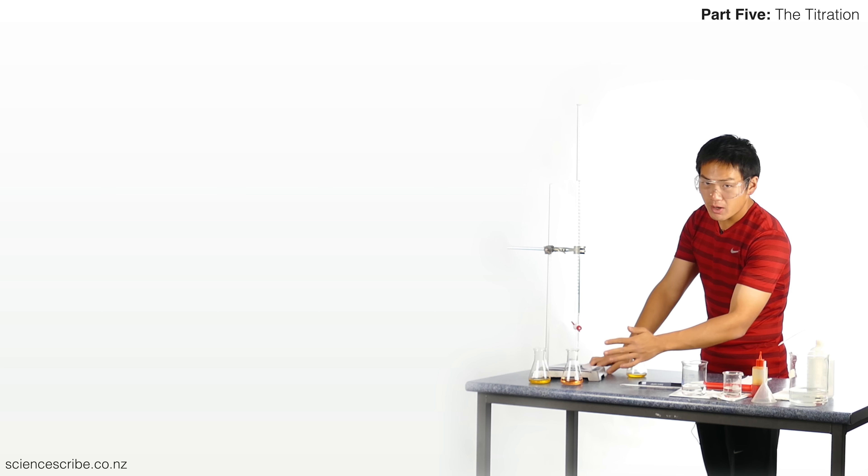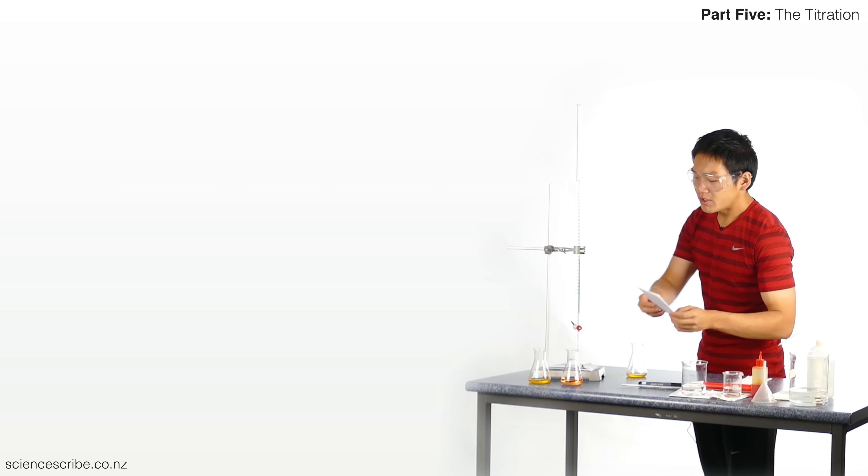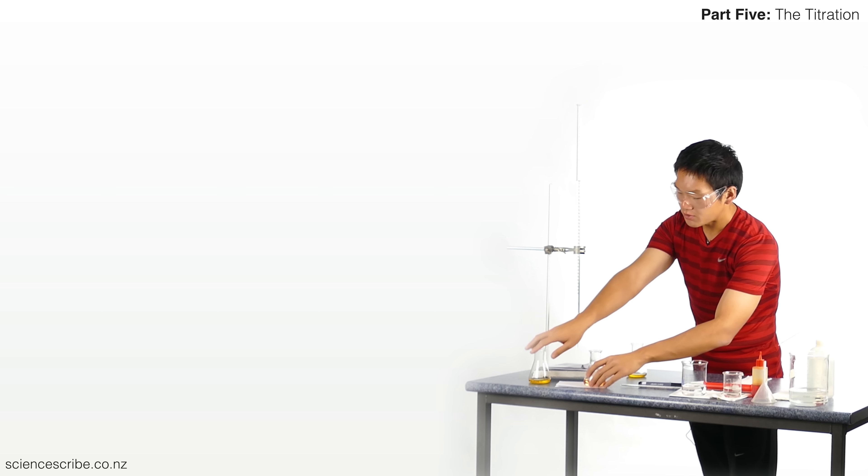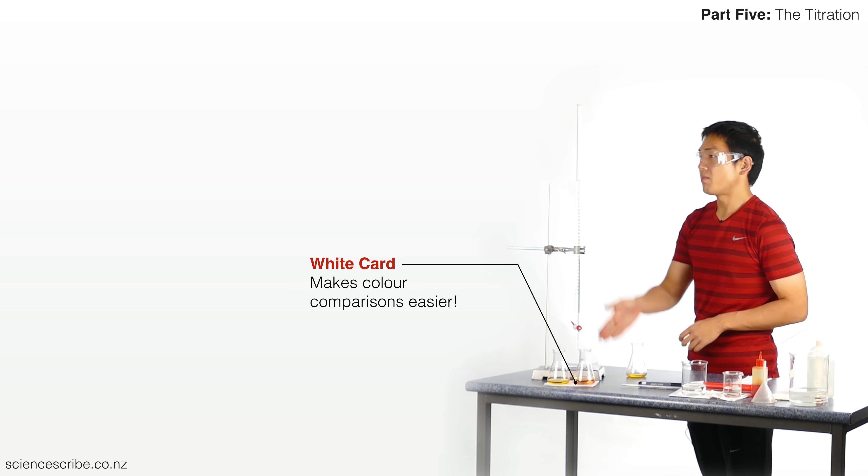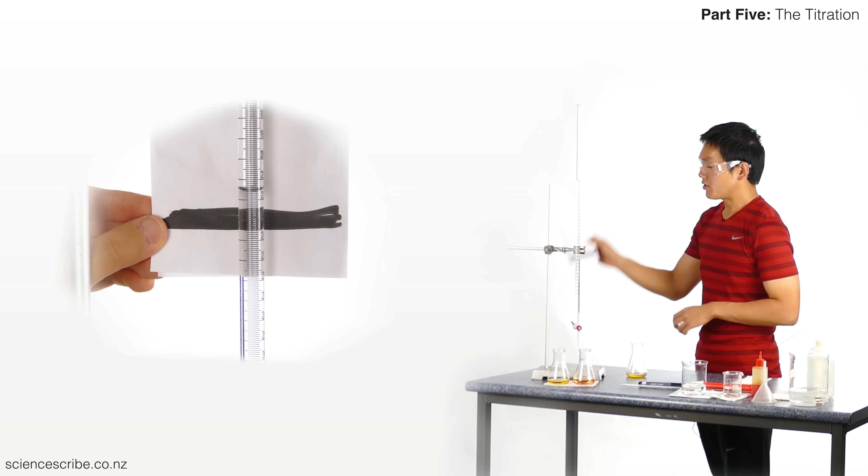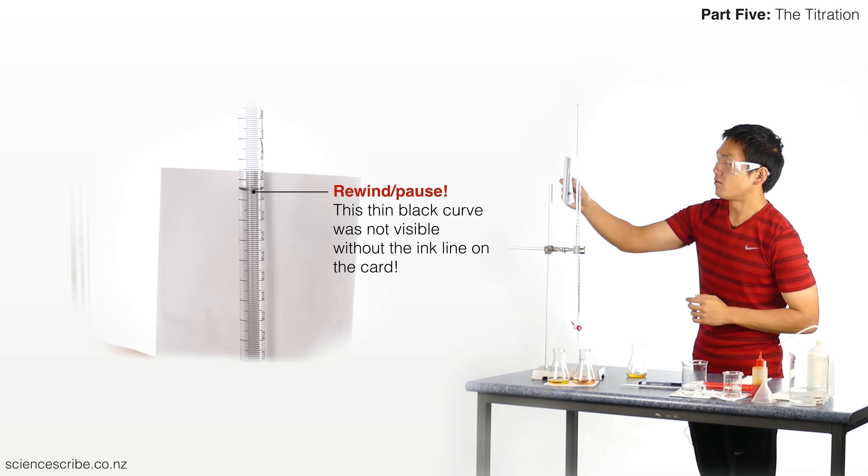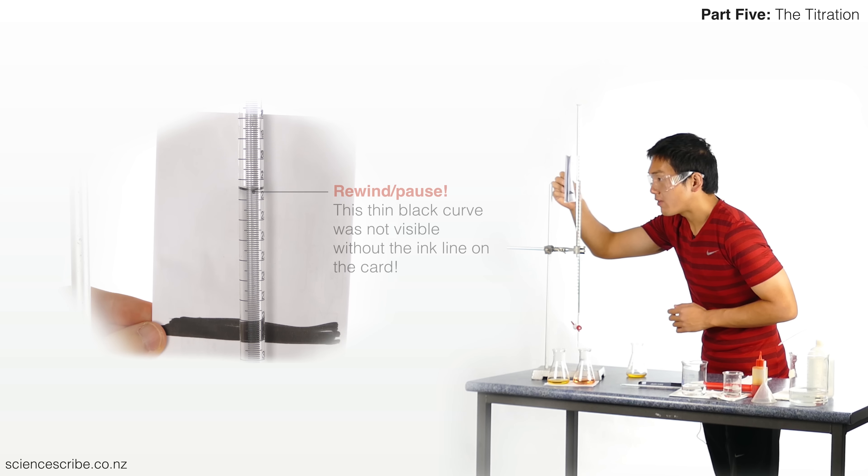Since I am comparing my colors, I'm also going to use another white card just to place my other flasks on top, because I want to get a good and accurate comparison. Before I start, remember I'm going to check my burette to make sure that everything is nice and dry, that there's nothing dripping. Remember, I'm using a card with a black line so I can read the meniscus. This time it's a real titration; I make a note of that to myself.